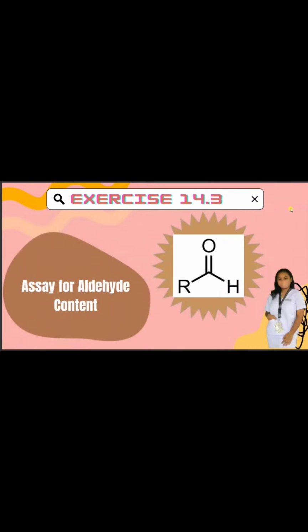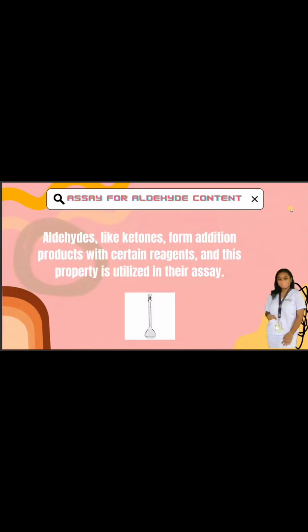meet official requirements. So, in exercise 14.3, assay for aldehyde content, aldehydes like ketones form addition products with certain reagents, and this property is utilized in their assay. When no other constituents are present which react with the reagent, the assay for aldehydes may be performed by the bisulfite method described later in this chapter under the assay for ketones. Thus, the cinnamic aldehyde content of the official cinnamon oil is determined by this method.